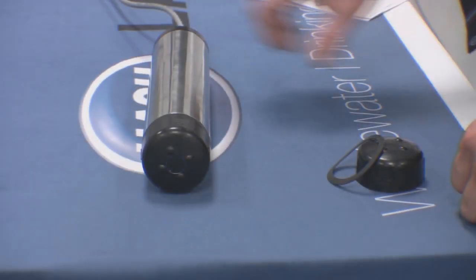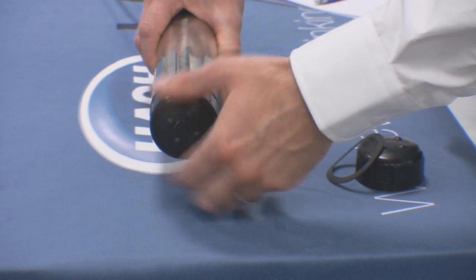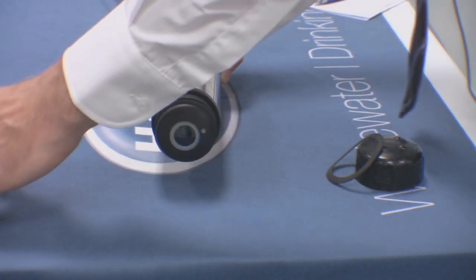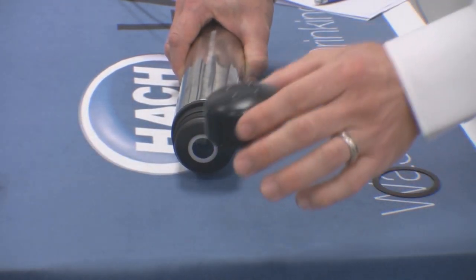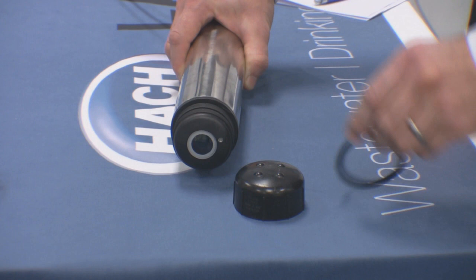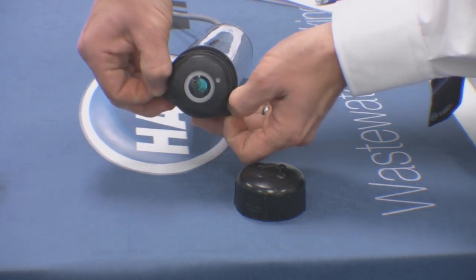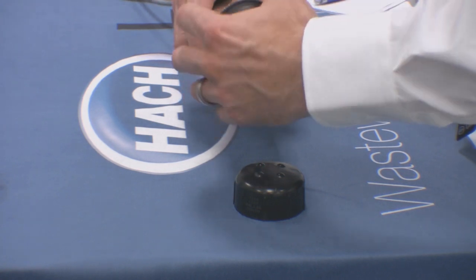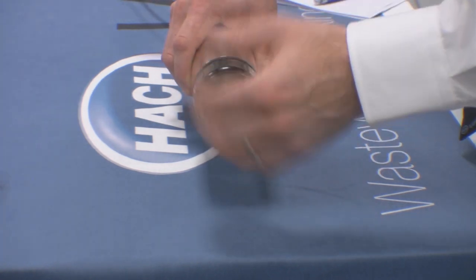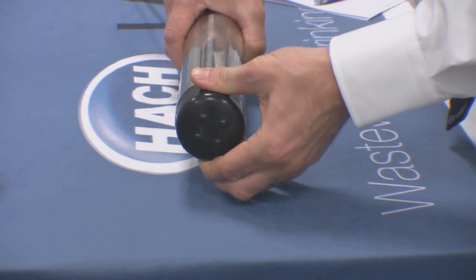In order to change the cap, take the probe out of its application and remove the old cap and its sealing ring. When you order a new cap, you will receive both the cap and a new sealing ring. The sealing ring sits in the sealing groove, so ensure the sealing groove is cleaned and free of debris to ensure a good fit. Place the sealing ring in its groove, then firmly fit and hand-tighten the sensor cap.